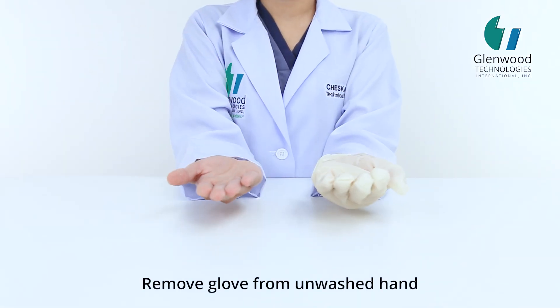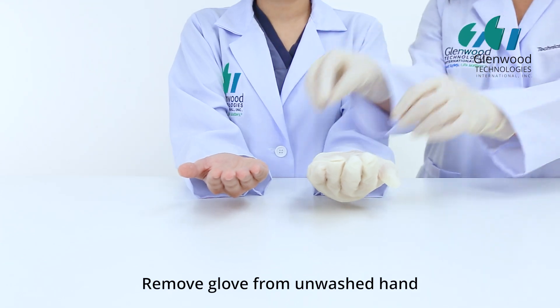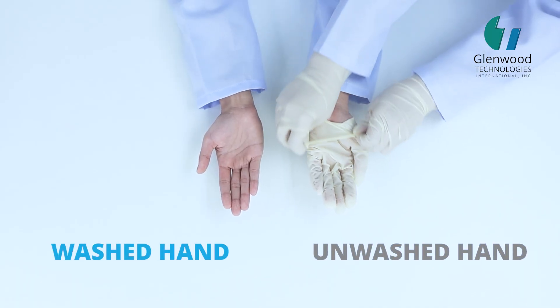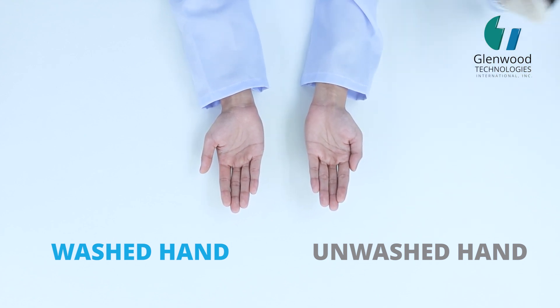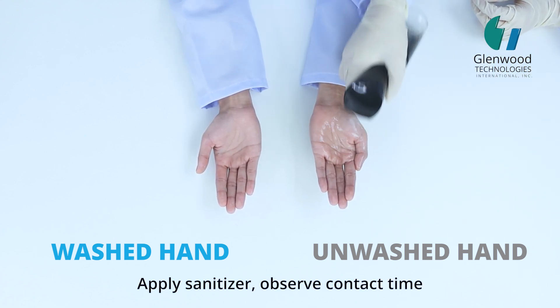Remove the glove from the unwashed hand. Apply sanitizer and observe contact time.